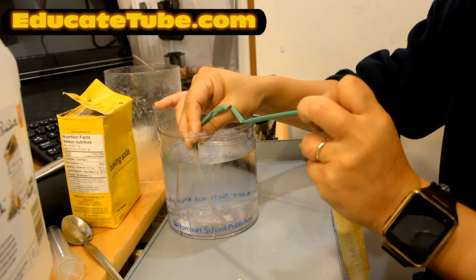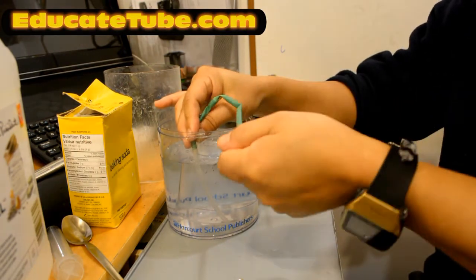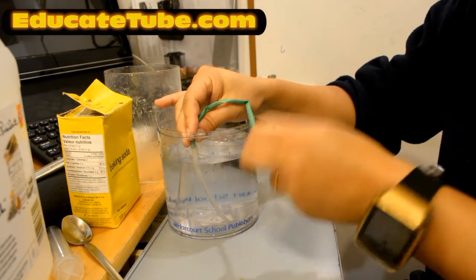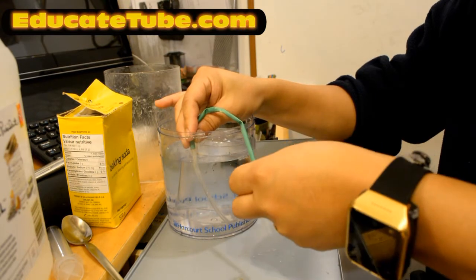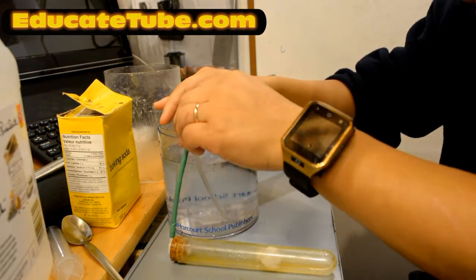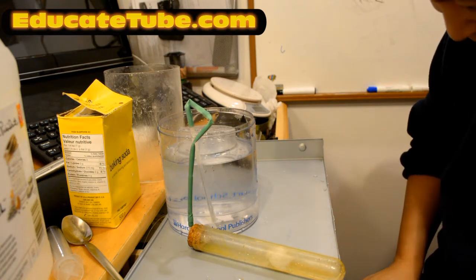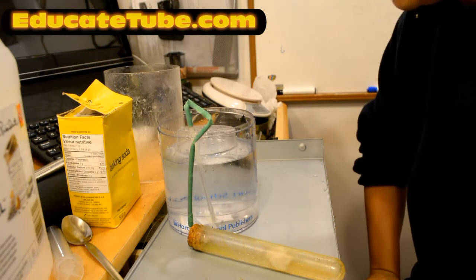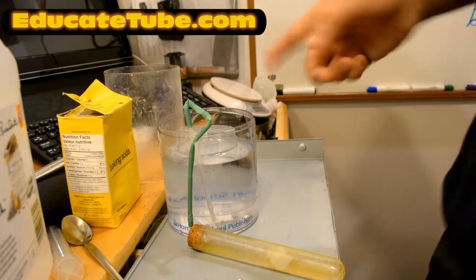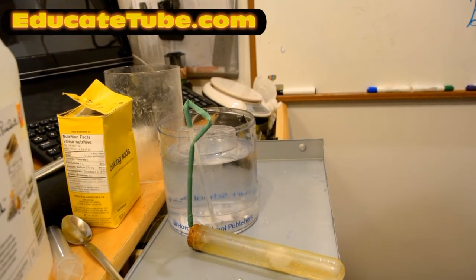Oh, there's some hole in here. Okay, so that's a problem. Oh man. Okay, I need to repeat this experiment. I need a rubber stopper. Well, it's still bubbling, so I'm going to leave it for now. I did lose some gas along the way, but we'll see how much air I have in here. At least it's still bubbling, which is a good sign. Alright, so we're going to measure the volume later on, to see how much volume is displaced once it's finished bubbling out the gas.